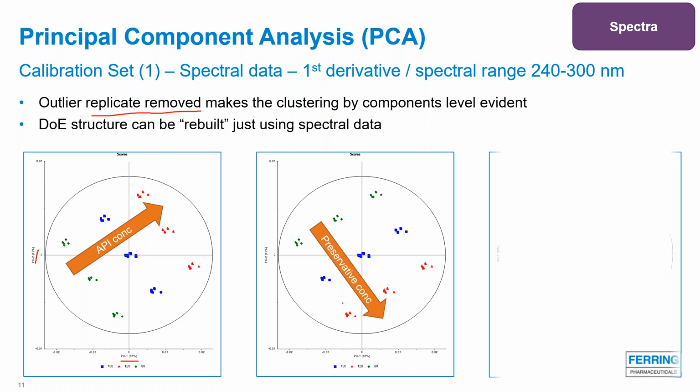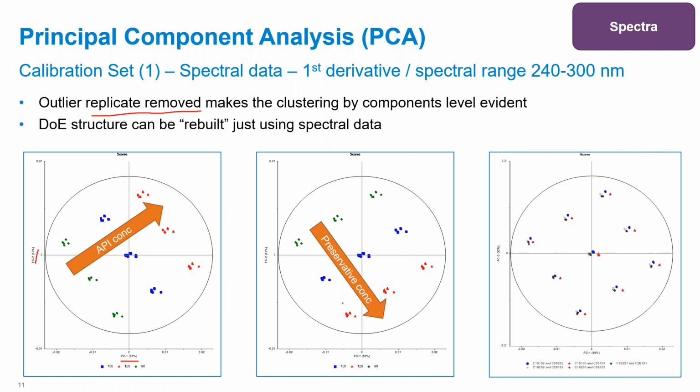And to convince you about this, I have here plotted the same graph using now the usual coding, which is the replicate. I've excluded one of them, which is an outlier, and therefore we have only 5 different colors on this graph.